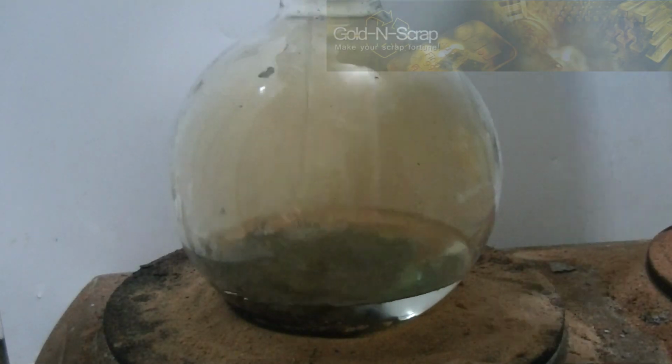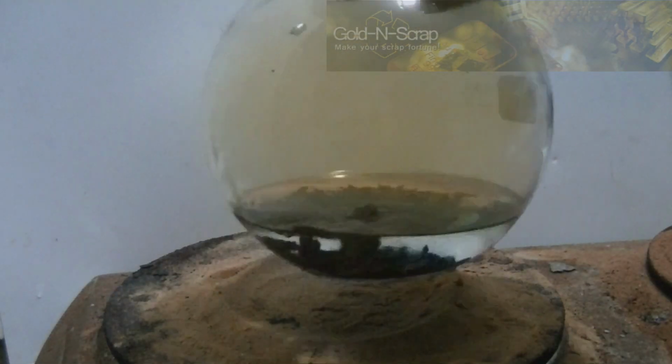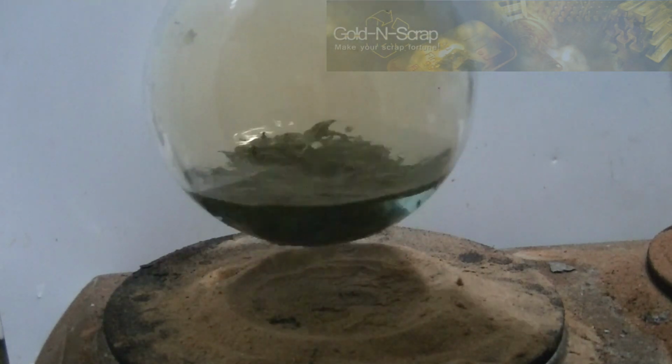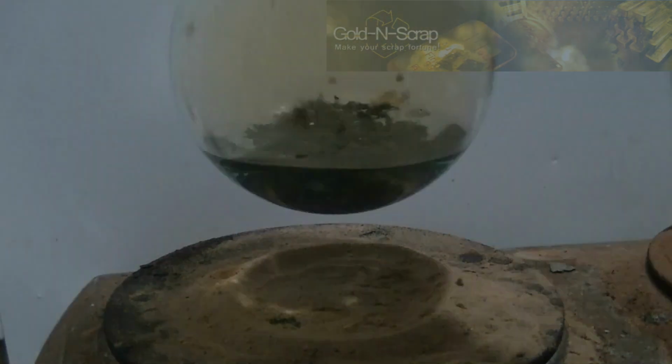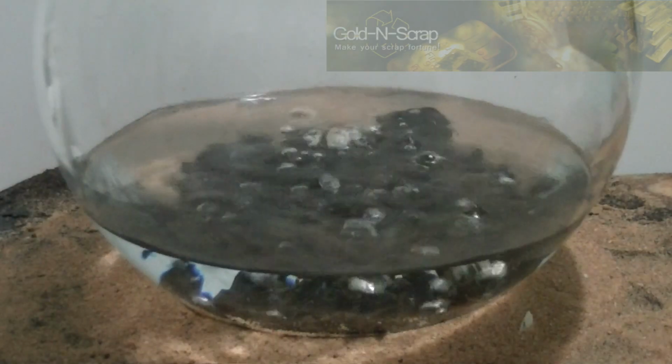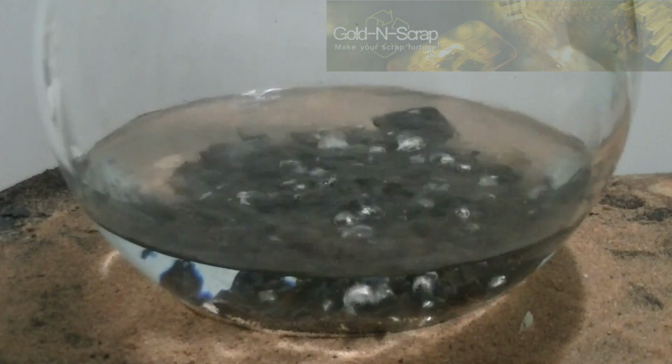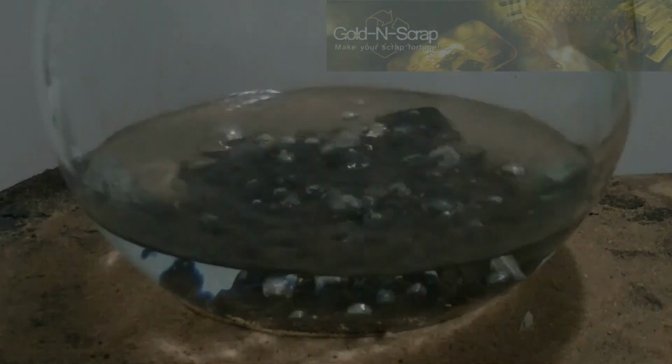The next step is to clean the gold sponge from the silver and base metal solution. To do that, we will wash the sponge several times with boiling hot distilled water. Repeating these washes 3 to 5 times would be enough. The wash water is kept separate, so it could be reused on the next batch.